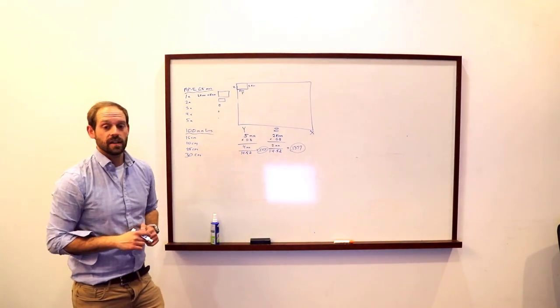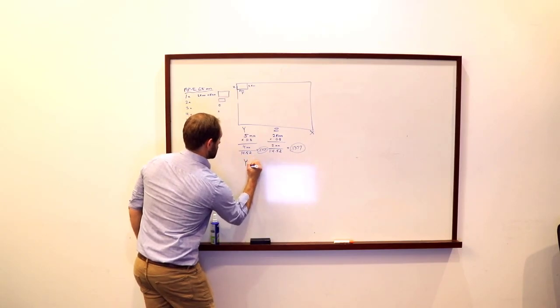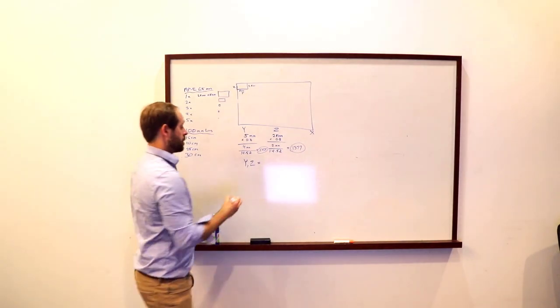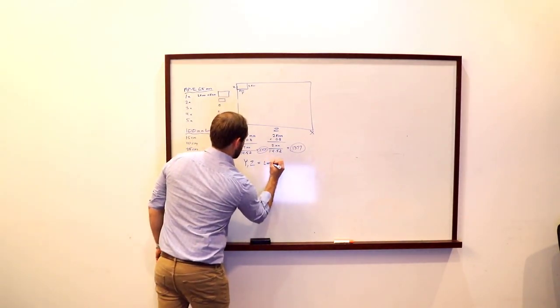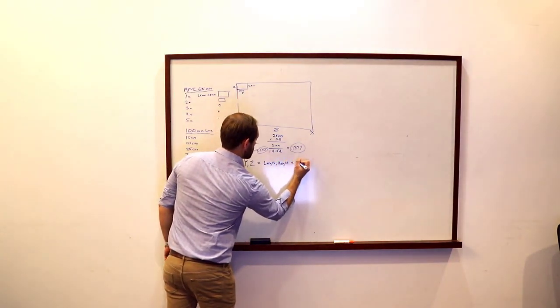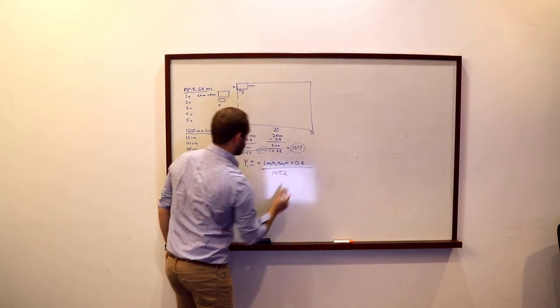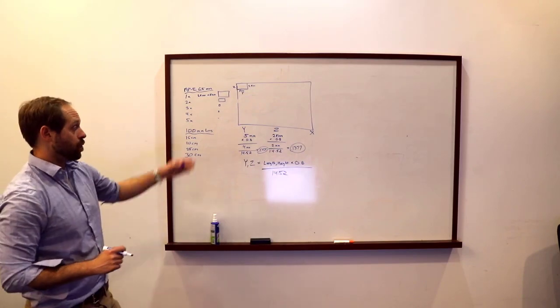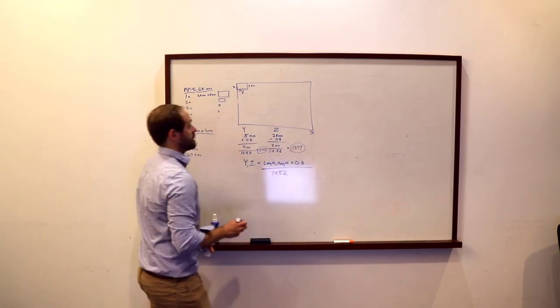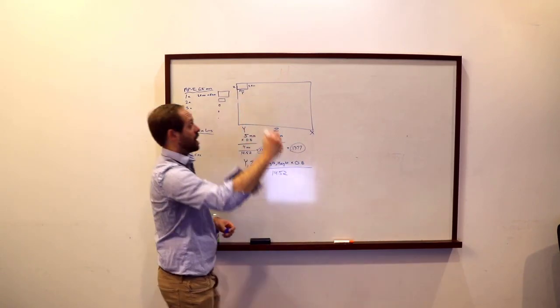But again, just for your understanding, the formula for these, so either the y or the z axis, is going to be either your length or your height times 0.8 divided by 14.52. So that's the formula that you would have in order to set up your y and your z axes. Now your x-axis is denoted by your depth of field. Basically, looking down at this insect tray, that's the part that's coming up at you.